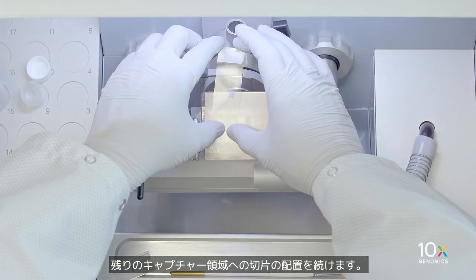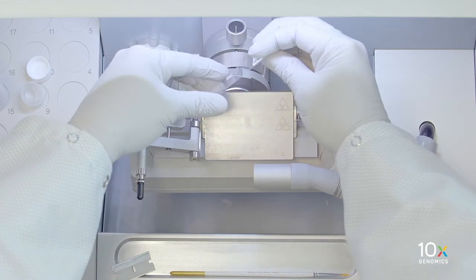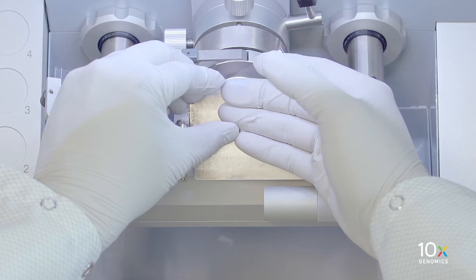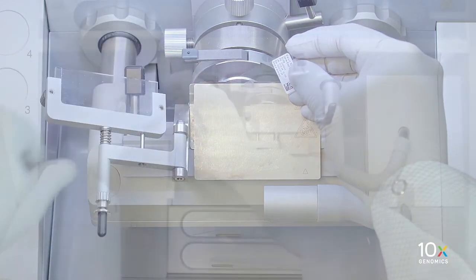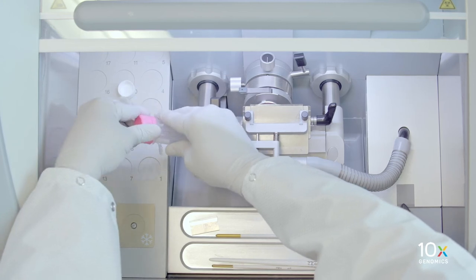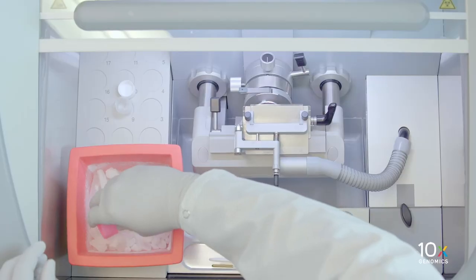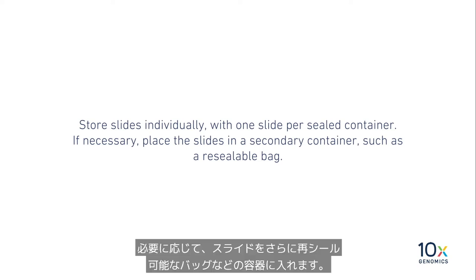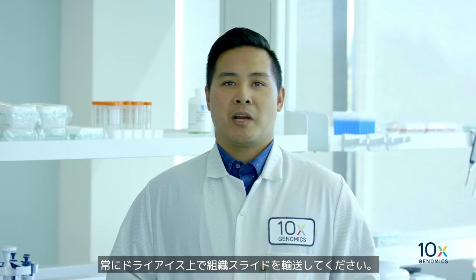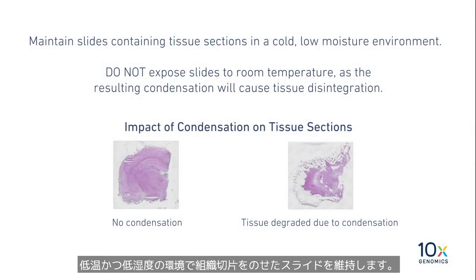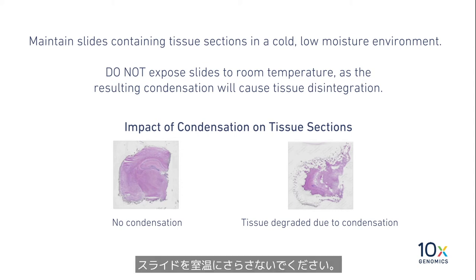Continue transferring sections onto the remaining capture areas. Transfer the slide containing the tissue sections to a slide mailer, seal, and place in dry ice. Store slides individually with one slide per sealed container. If necessary, place the slides in a secondary container such as a resealable bag. Make sure to transport the tissue-containing slides on dry ice at all times.